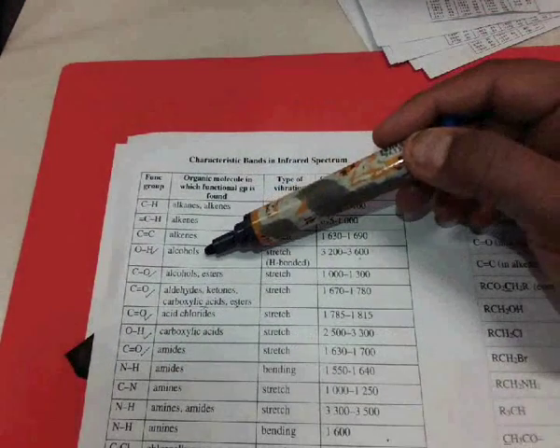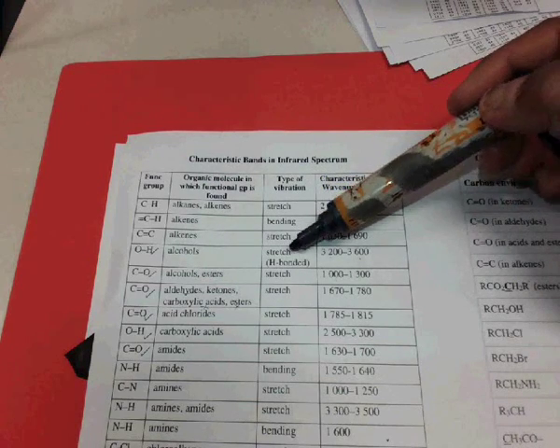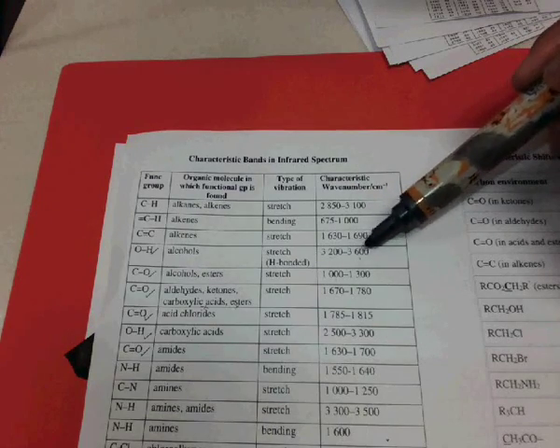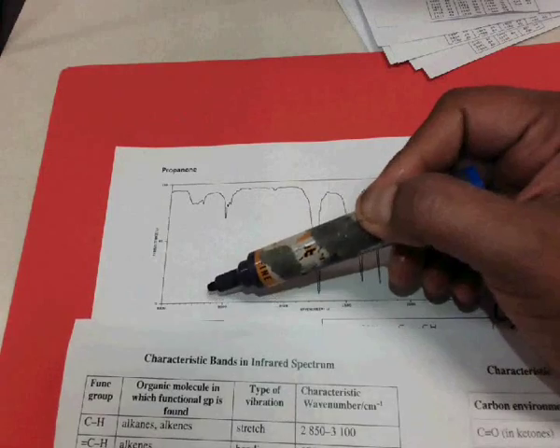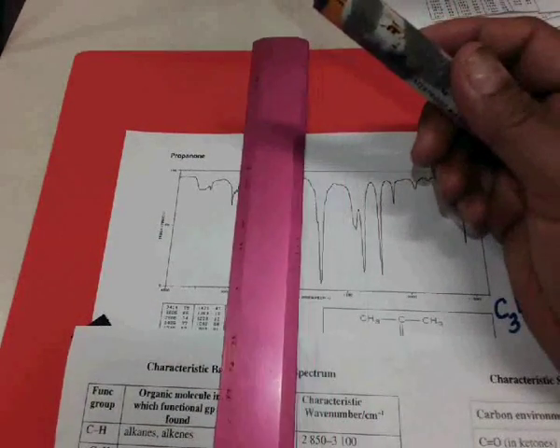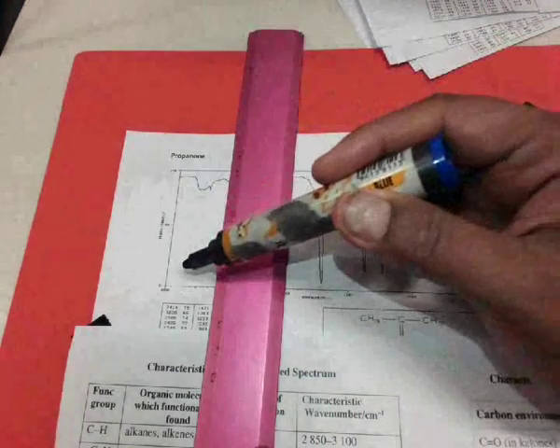If it was an alcohol, there would be a stretch or some sort of peak between 3200 and 3600. So 3200 is there, and 3600.